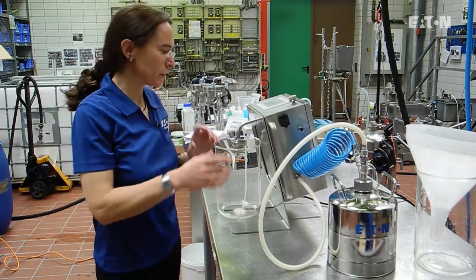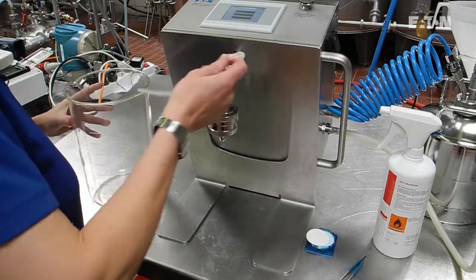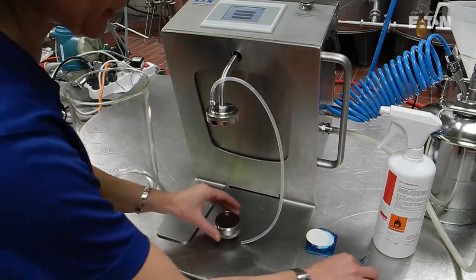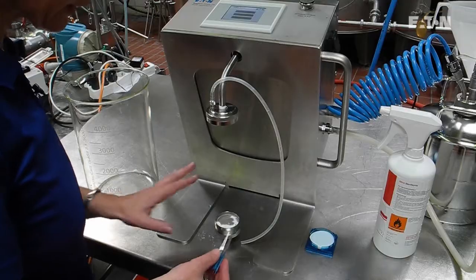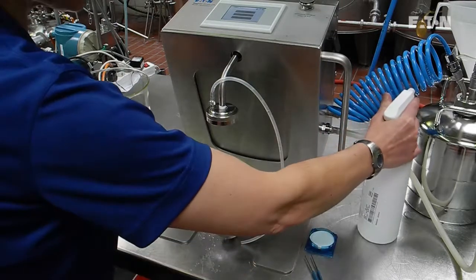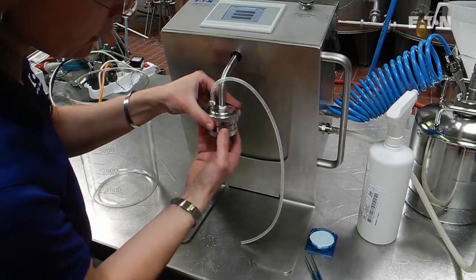The next step will be to put in the membrane. We start to prepare the filter membrane by opening the filter holder, putting out the syringe, and placing it on top of the complete element. We take a membrane — it is a PVDF membrane, 0.45 micron — and it should be wetted completely. Afterwards, we take some ethanol and spray it lightly over the membrane so that there are no hydrophobic areas on it. The last step is to close it, and that's it.